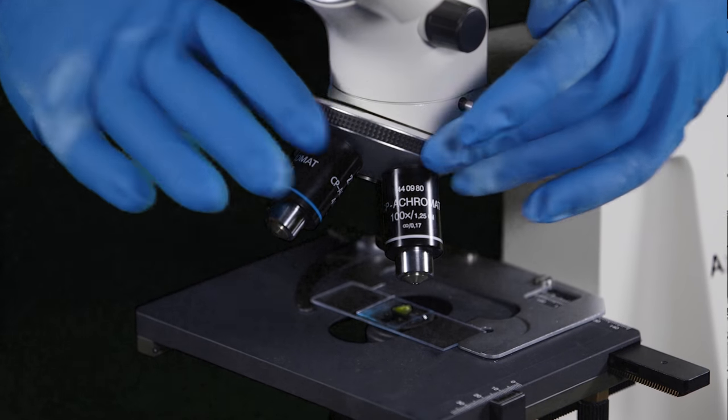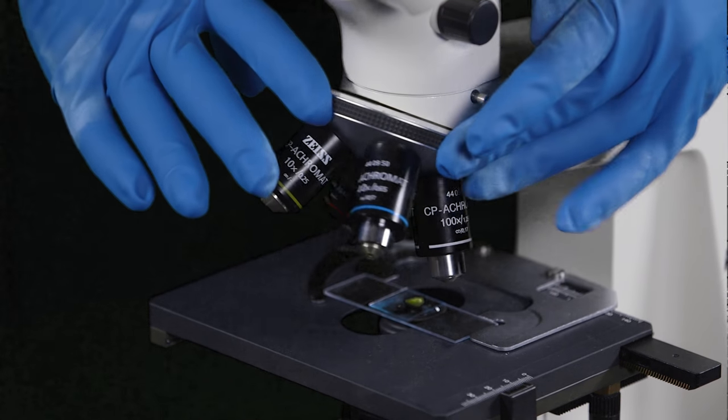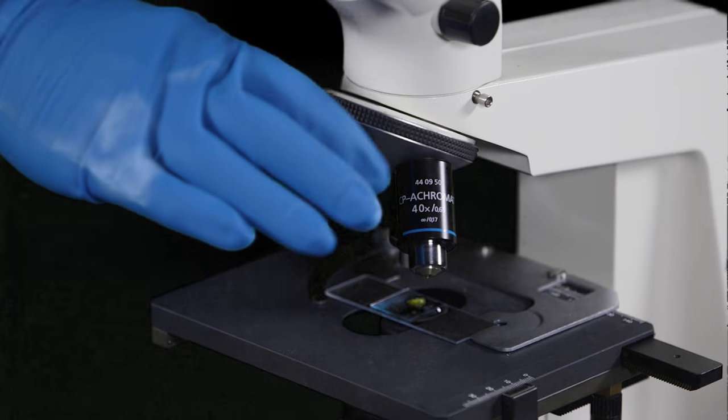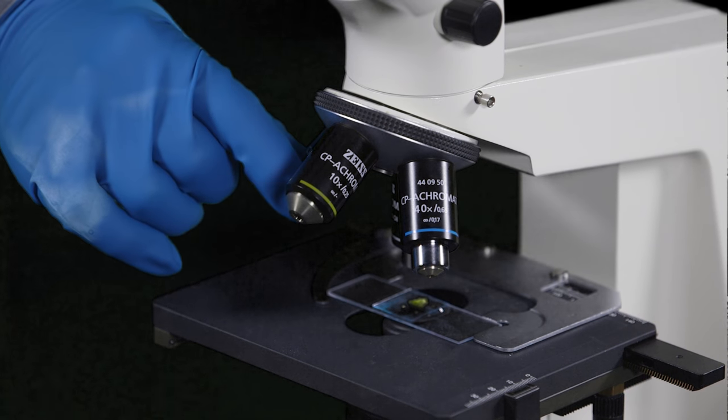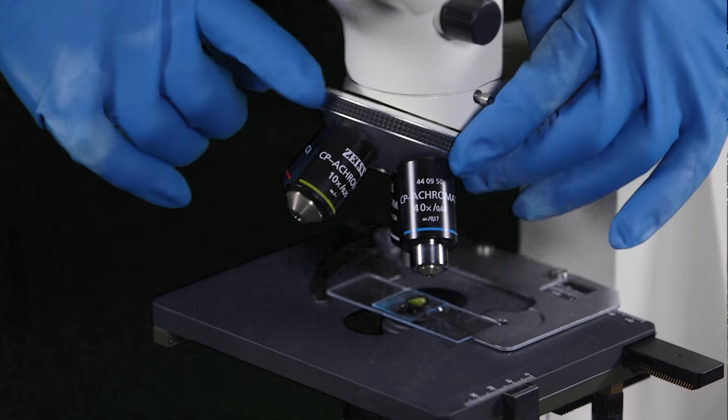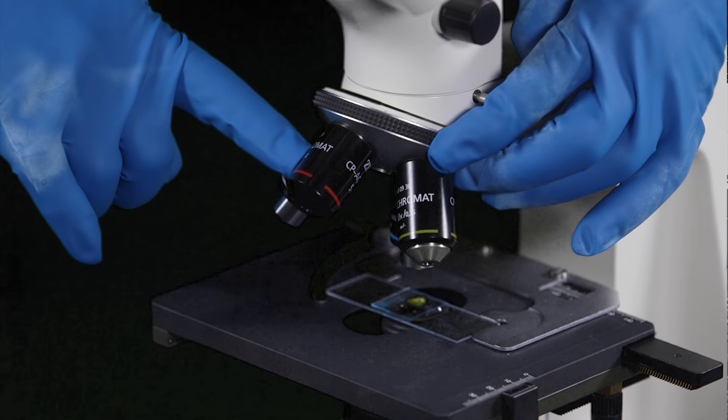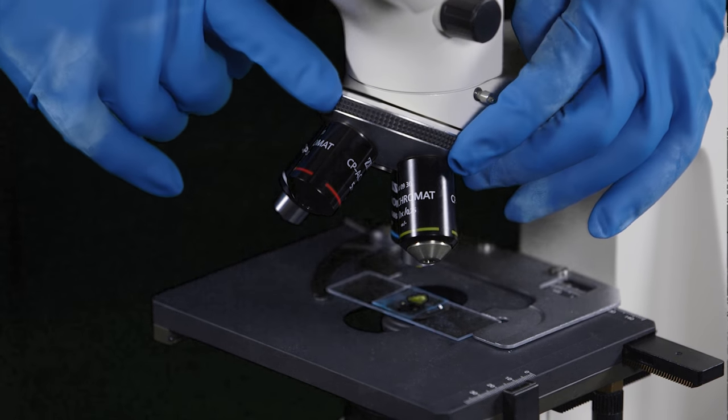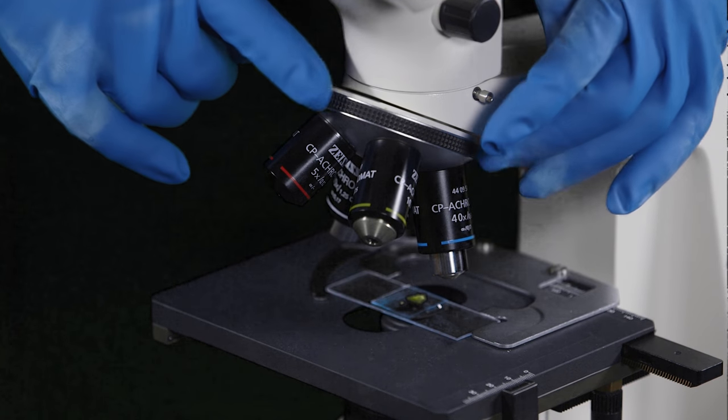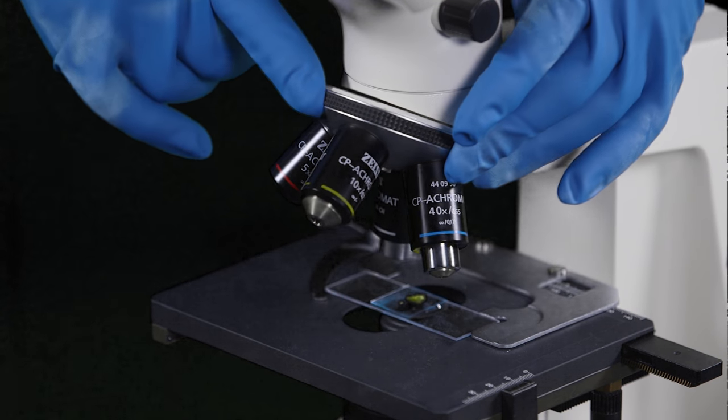Grip the turret to rotate the objectives. Do not pull or push on the objectives. Here is your lowest power objective, also referred to as the scanning objective. That's a 5x objective on this scope.